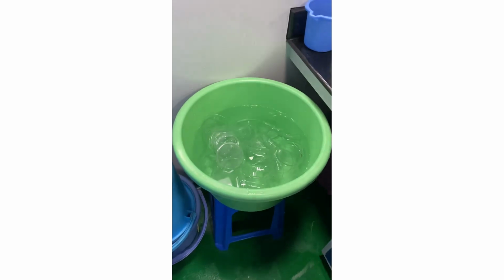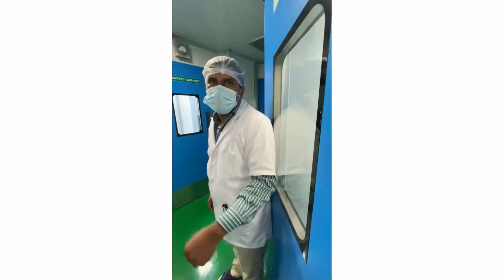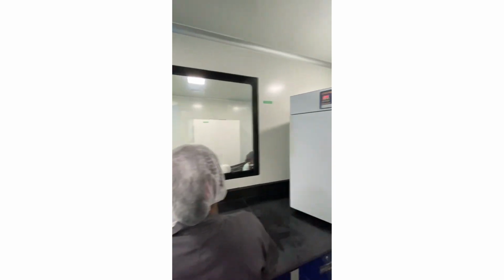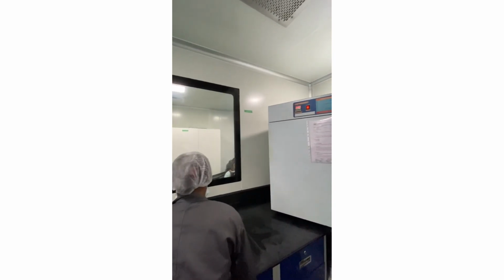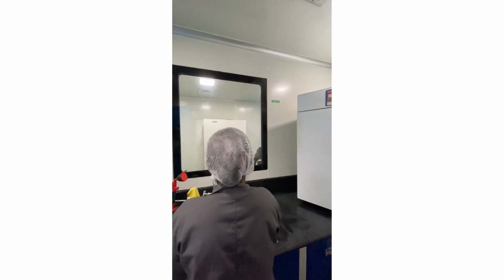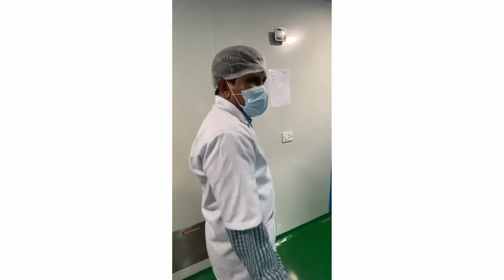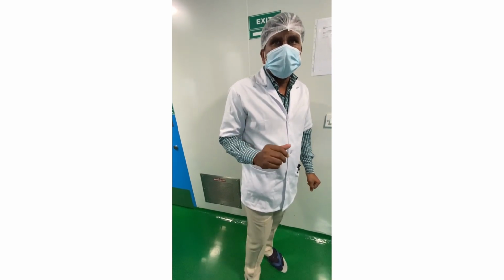We are washing the plates with RO water and also rinsing in 70% ethanol. After washing, we keep them for dry heat sterilization in this equipment at 160 degrees centigrade for 2 hours. Otherwise, we can't justify whether this product is free from microorganisms or not.